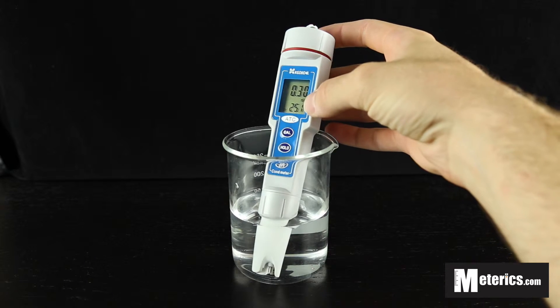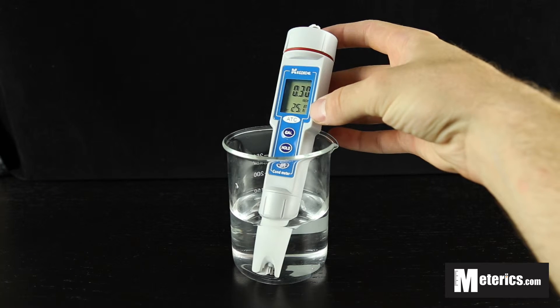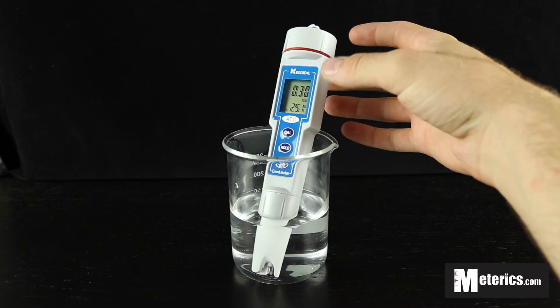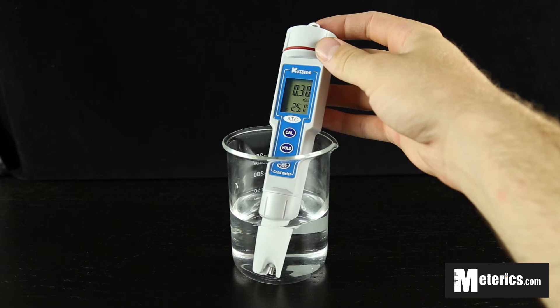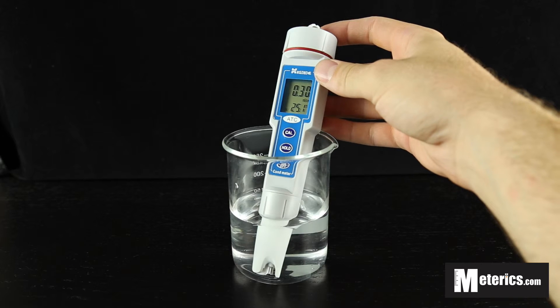You can see that right here, and then down here is 25.1 degrees Celsius — that is the automatic temperature compensation. So depending upon the temperature of your sample, it auto-corrects so it won't affect the readings, which is a pretty nice feature.